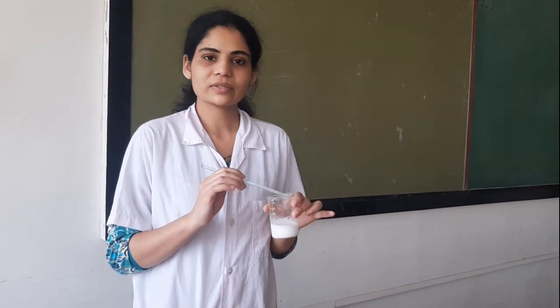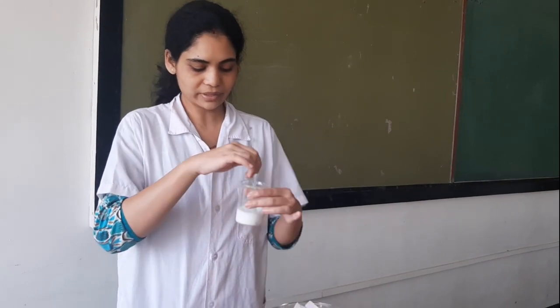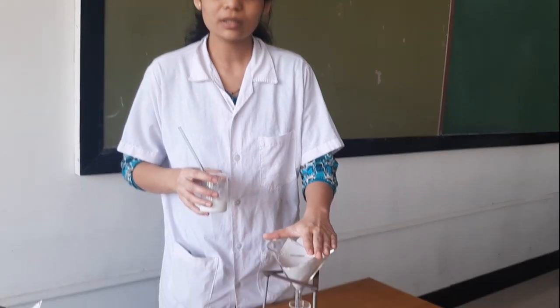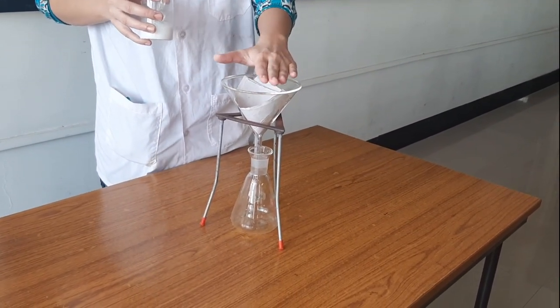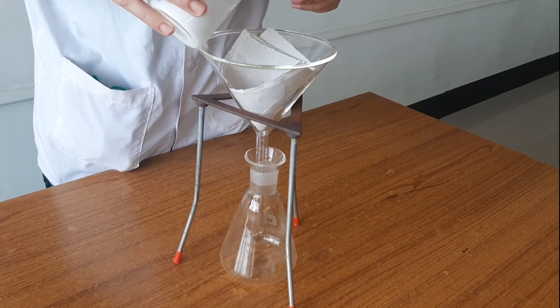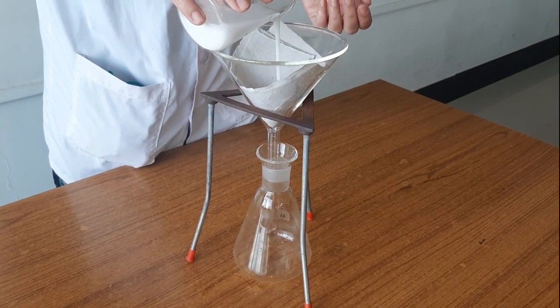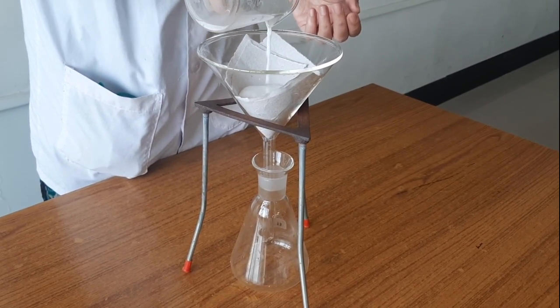Now this is our 5% slurry of calcium carbonate in water. We have taken 50 ml of that slurry, and this is our funnel A, which has the highest diameter. Through this funnel we are going to pour the 50 ml of slurry. You have to shake the slurry because calcium carbonate tends to settle at the bottom.